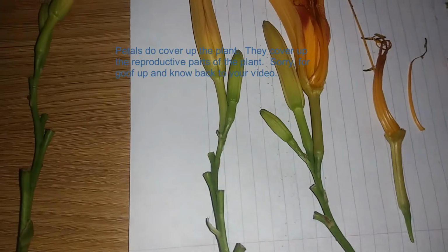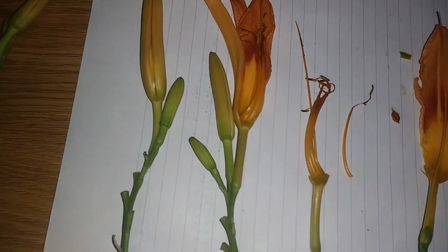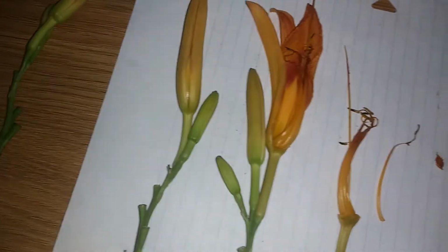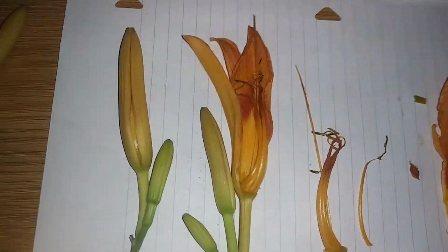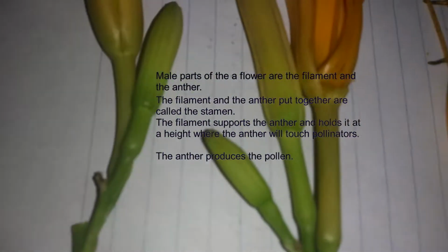Now, the first part that we're going to look at are the male parts. Okay, and the male parts of the plants basically are called stamens. And the stamens are made up of two parts, the anther and the filament.